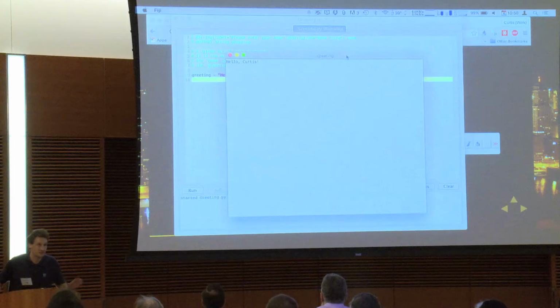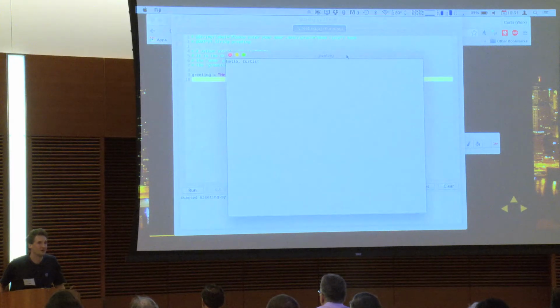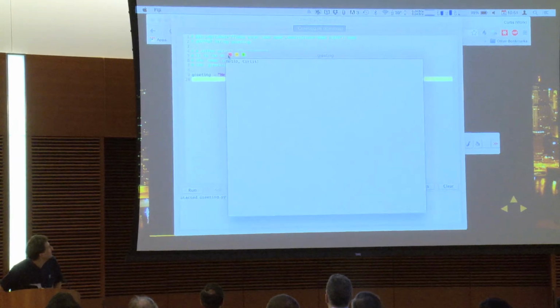Now, you might argue that this isn't very beautiful, but I see that as a lesser issue because the good news is, to make it more beautiful won't require any code changes on your part. You can write all your scripts now, and as ImageJ2 gets better and the greeting window becomes less ugly, everybody will win, automatically. It's a nice thing about the core.